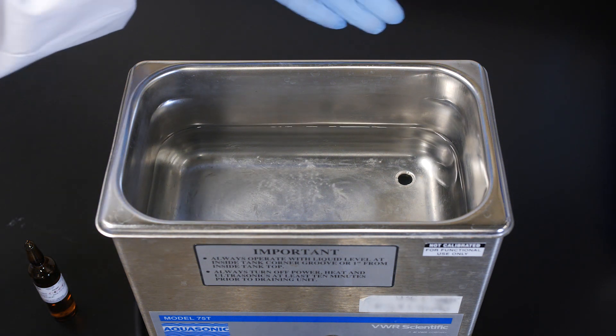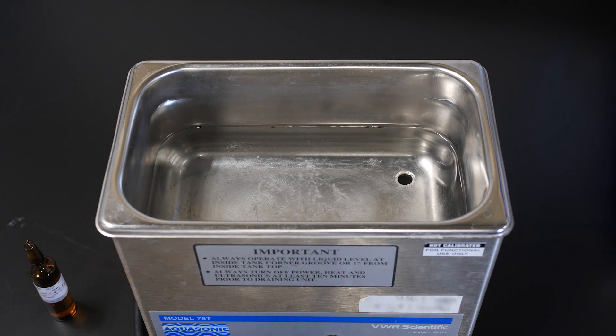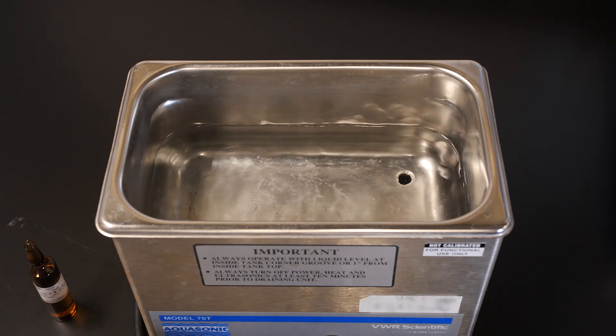To sonicate, first check that the sonicator is free from mineral buildup. Next, ensure there is enough deionized water in the bath. The water level may depend on your lab's procedures and equipment.